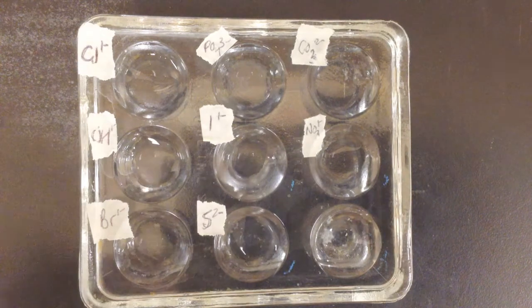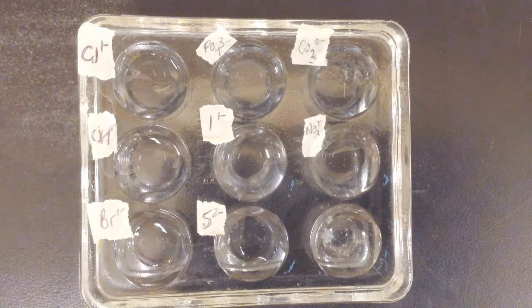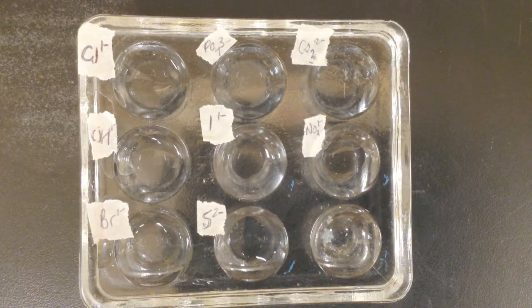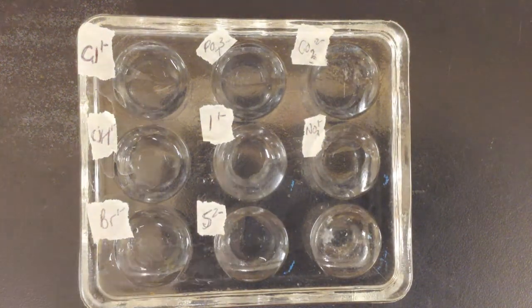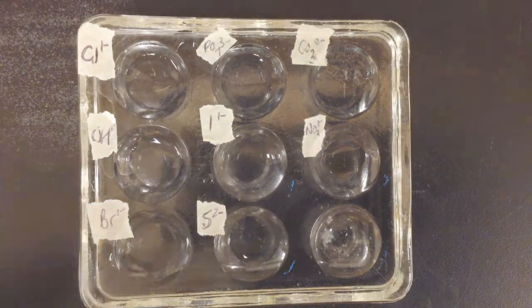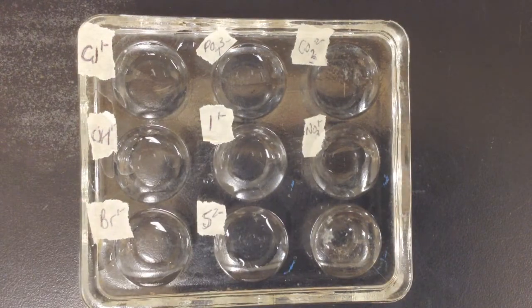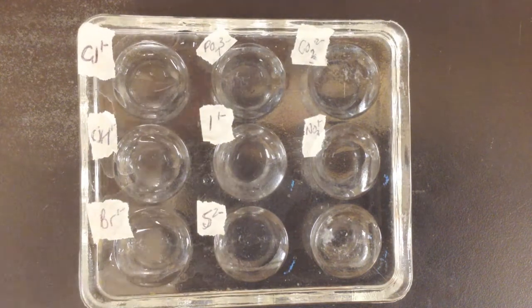Nothing much there. OH, hydroxide. Nothing much there. Bromide. Phosphate. Iodide, sorry. Sulfide. Take the cap off, that helps. Carbonate. And last but not least, nitrate.